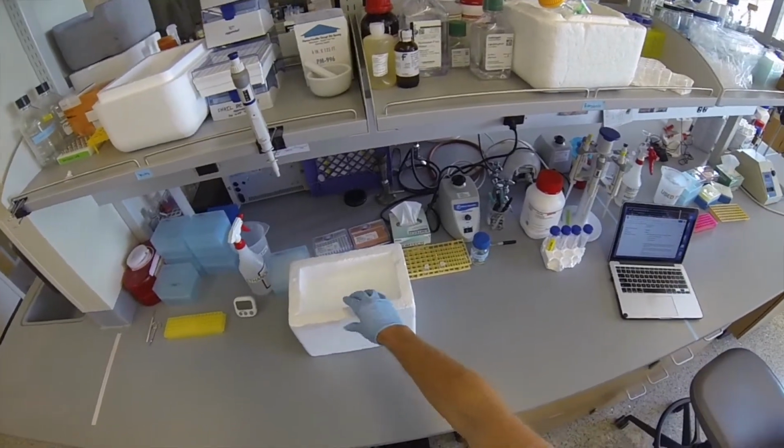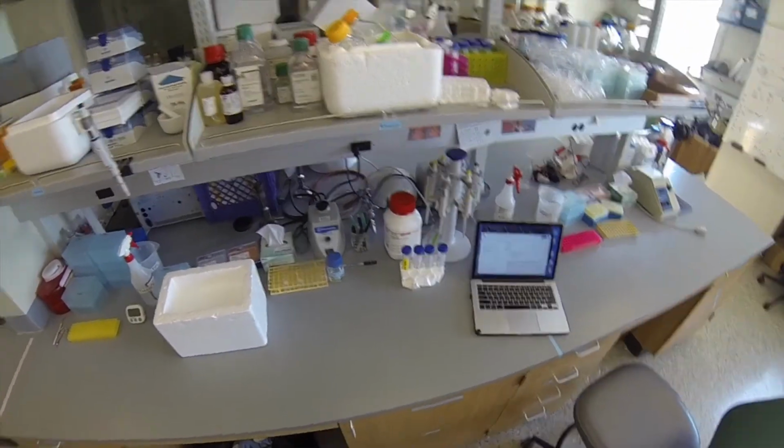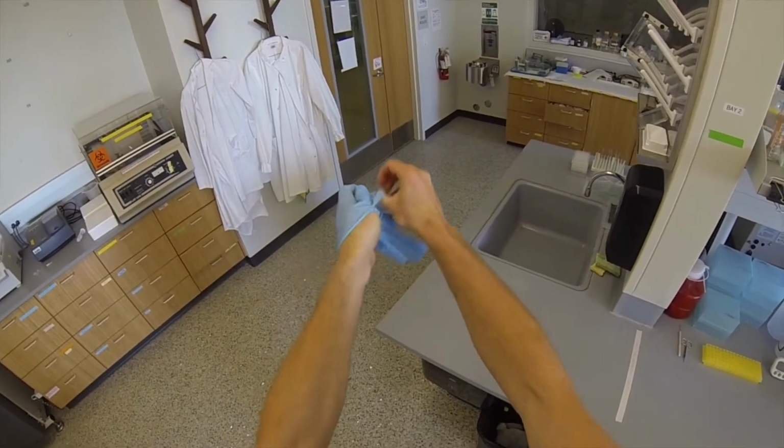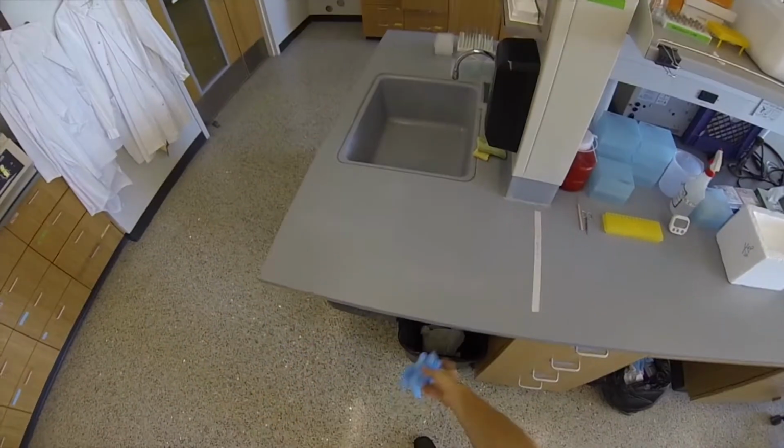Once you are ready for your samples, you will remove your gloves and bring the cooler of ice to the refrigerator room. You'll then grab the 20 samples you've been assigned out of the freezer and bring it back to lab.